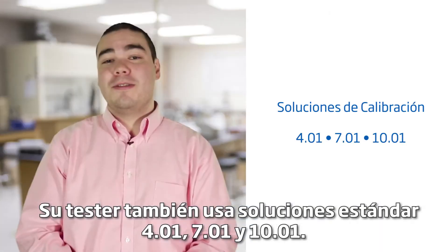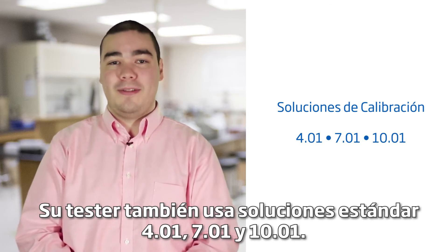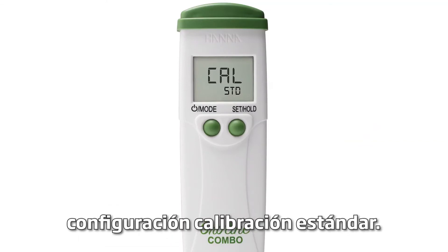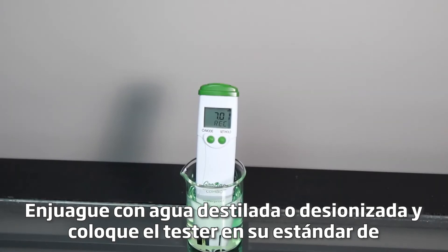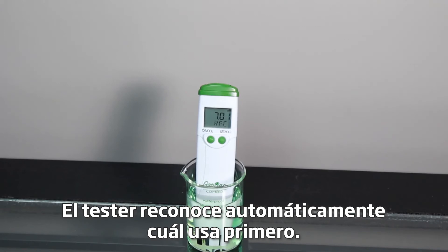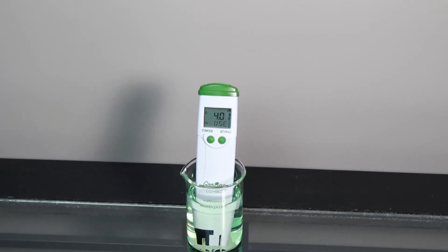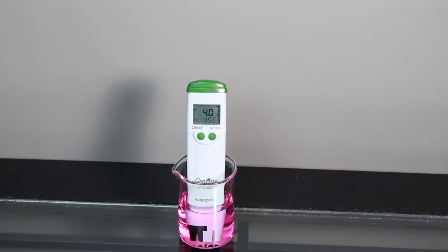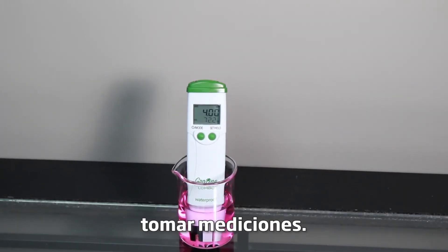Your tester also uses standard 4.01, 7.01, and 10.01 buffers. To calibrate your tester to two points, first be sure you are in the Cal standard setting. Rinse in distilled or deionized water and place the tester in your Hanna calibration buffer and wait for a stable reading. The tester automatically recognizes which one you use first. Once stable, it will ask you for the next buffer. Be sure to rinse your tester in distilled or deionized water and place it in the next buffer. Once recognized, the tester will go back to measurement mode and you are now ready to begin taking measurements.